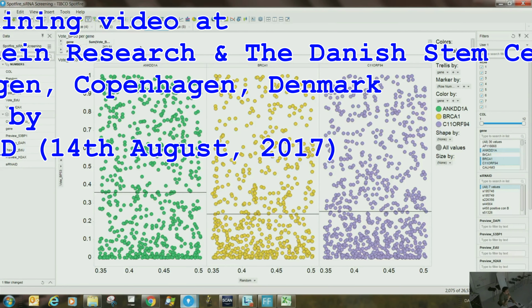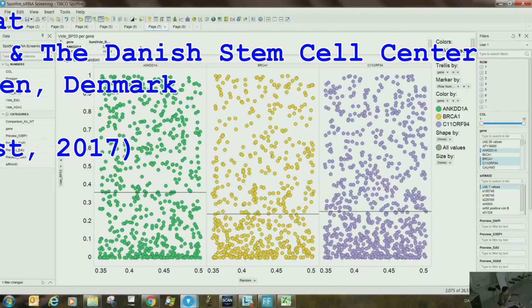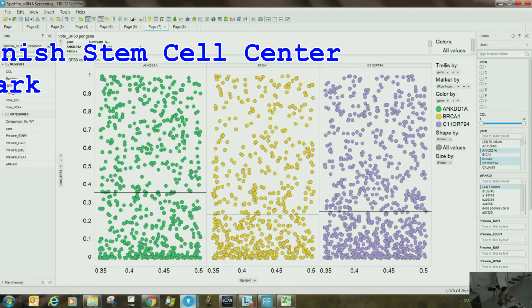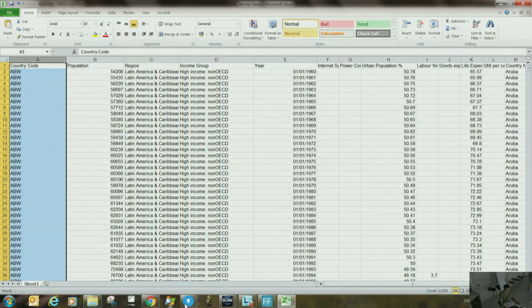I mean, the project that I was handling with the second floor CPR, that was the live cell, and these were two channels that were cyclin B1. But that's completely different, right? Because they wanted to know the transition between these two. Yeah, exactly. Okay. Thanks a lot. So for example, Feynman, Kai, and the rest, I think they all select primarily on DAPI.